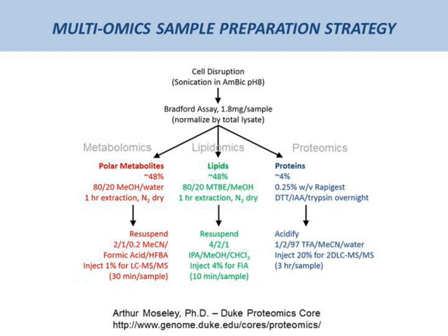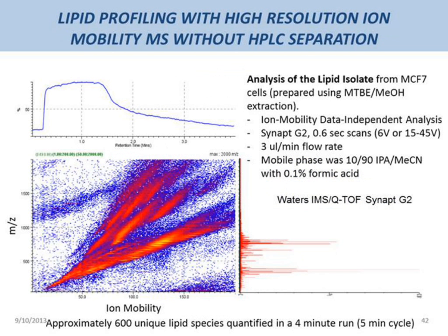In addition to sample preparation issues, lipids, for instance, present a new set of challenges. There is no straightforward way to identify a lipid molecule since there are no genes that directly encode lipid structures as they do for proteins. Moreover, many lipid species are isobaric, meaning having the same molecular weight, positional isomers that possess distinct biological functions in the cell and therefore need to be quantified separately. Until recently, mass spectrometers could not easily distinguish between isobaric species, so high chromatographic resolution and long HPLC gradient runs were required for successful lipid profiling.